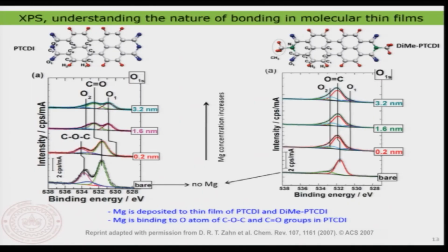But now I can also do something interesting with this kind of molecular film. In this particular example, I have chosen the same molecule, but you take the film and dope it with magnesium. That is a metal that you add in order to increase the transport property. I will show you in greater detail in an upcoming example the importance of doping in a molecular material, but this is not that important right now in this context.